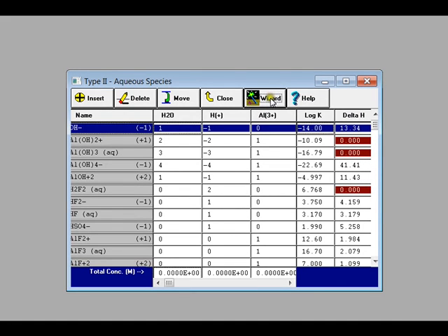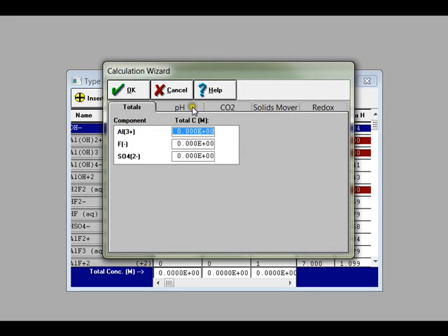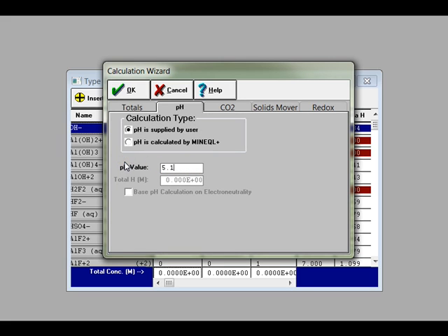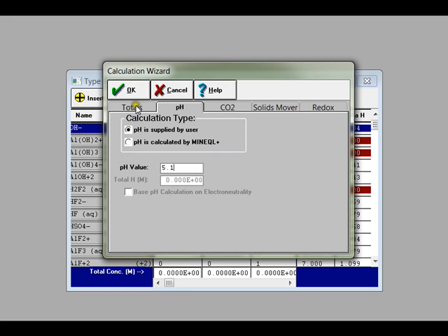Then to set the pH value, you go to the calculation wizard and select the pH tab. Make sure that the calculation type is set to pH is supplied by user, and then set the pH value to 5.1.